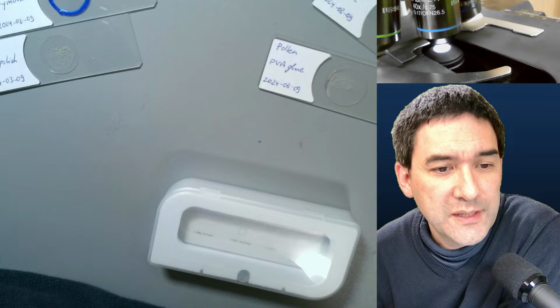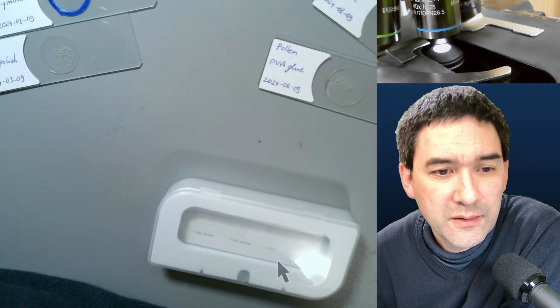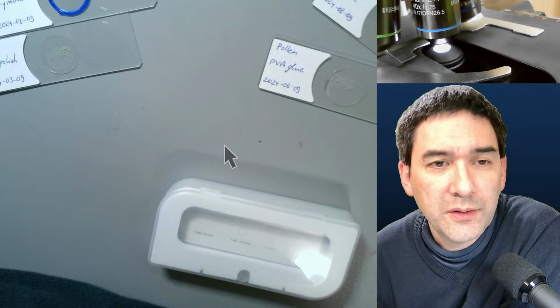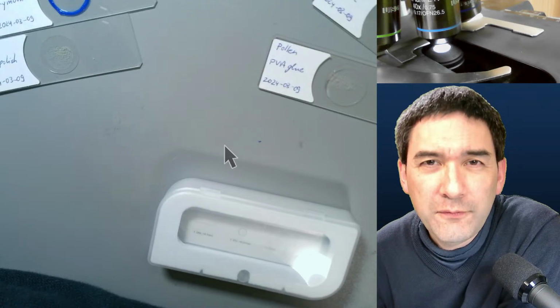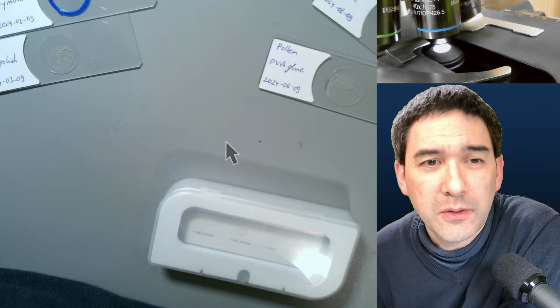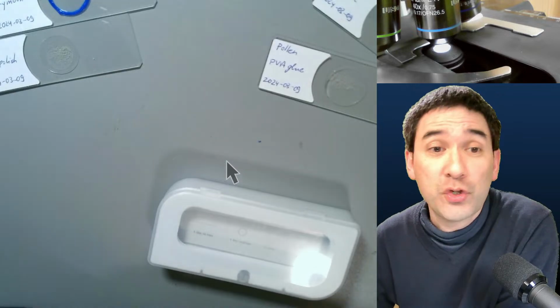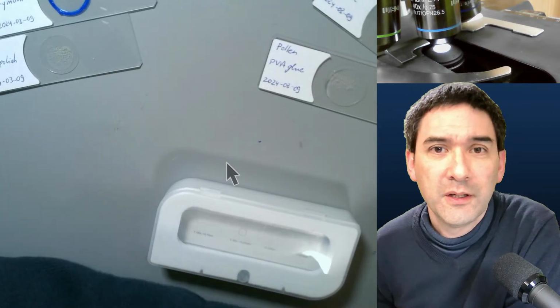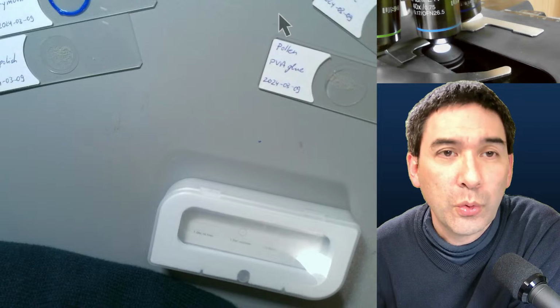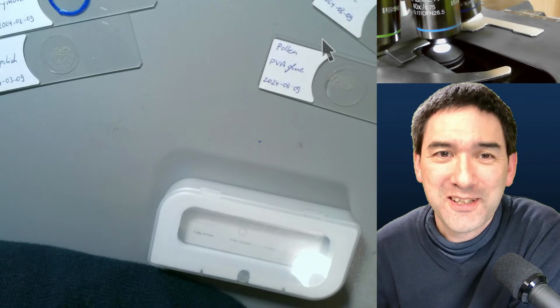So if you have, for example, over here, a pointer like this with a scale on it, then for each magnification I'd need a separate scale. But that's actually not even difficult to do. Thank you for the suggestion. What I could do is put all of the scales somewhere in the corner for the different magnifications, and then I can just use that.